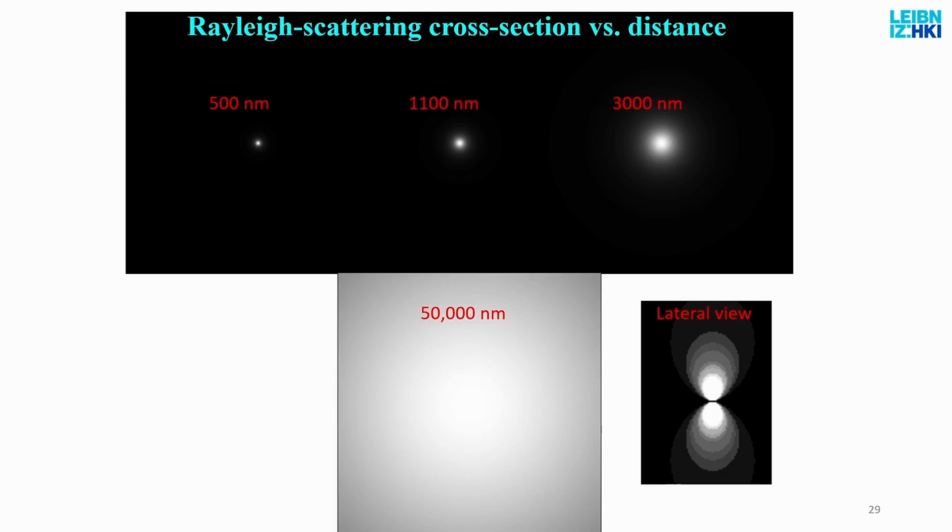And if you calculate what it looks like, I just did this on a computer, when I assumed that we had, I think it was a 4 nanometer object and Rayleigh scattering occurred. If I illuminate this object and I look from half a micron apart, it's really not that far, that's much smaller than the thickness of a cell. I already don't see the actual spot, I just see larger and larger scattered spheres. And this is still only 1 micron apart, this is 3 microns apart.